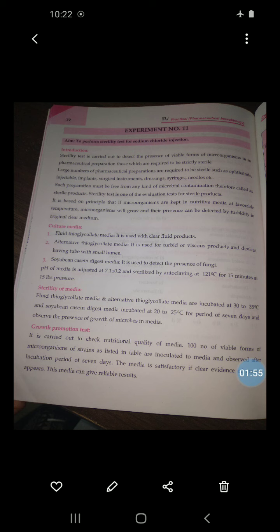Then we will see culture media. The culture media are: first, fluid thioglycolate media; second, alternative thioglycolate media; and third, soybean casein digest media. Fluid thioglycolate media is used with clear fluid products.